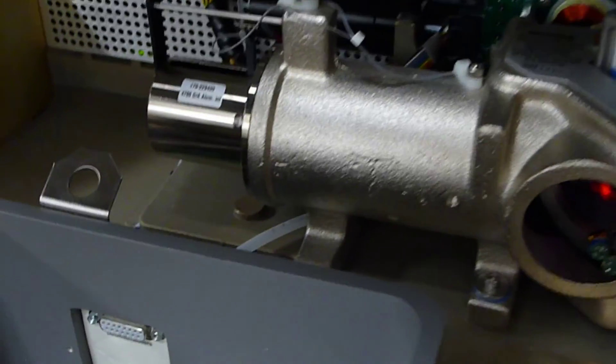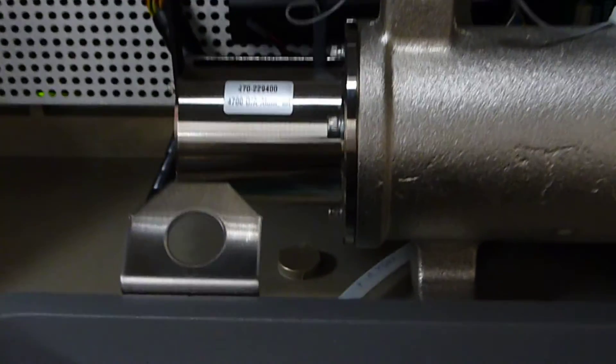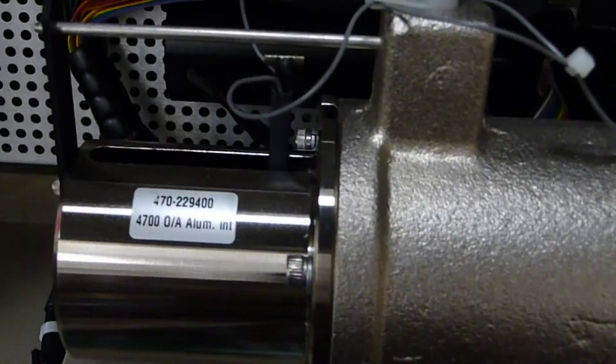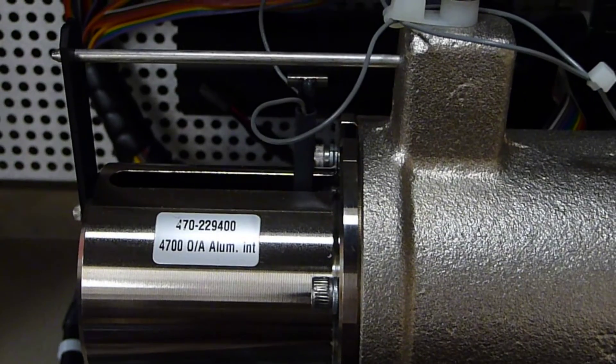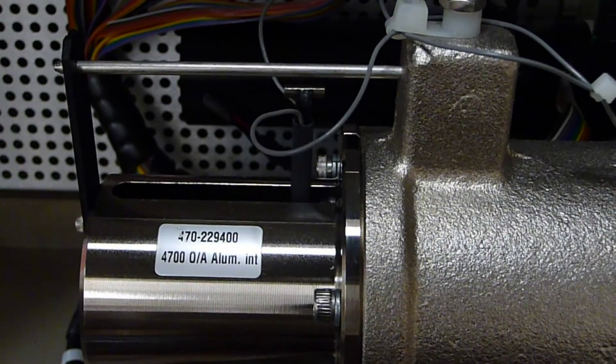Once again, the mirror as it scans — here's the actuator for it. And so if this thing is moving, the instrument is scanning.